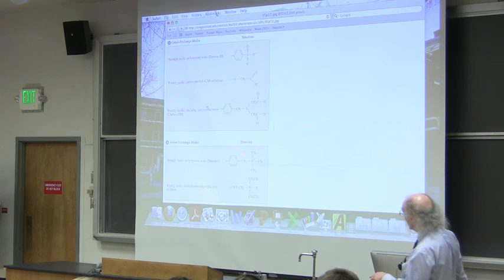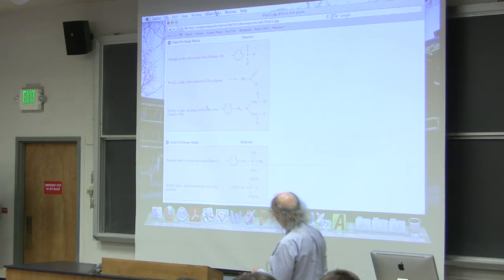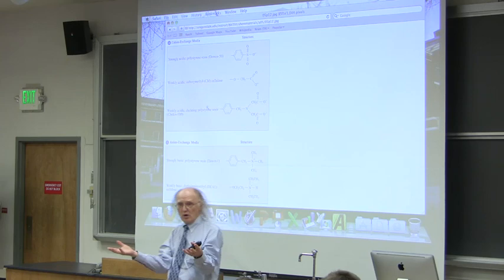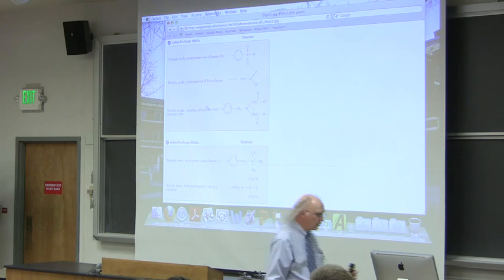We could do the other. We could have an anion exchange separation. Okay? In an anion exchange separation, we would have a resin attached to the bead that has a positive charge. In this case, the counter ion would be a chloride, which would be negatively charged. Anion exchange chromatography would bind to negatively charged proteins, and the positively charged proteins would come off first, the zero charged next, and finally the negatively charged proteins at the very end. Okay, kind of cool stuff.